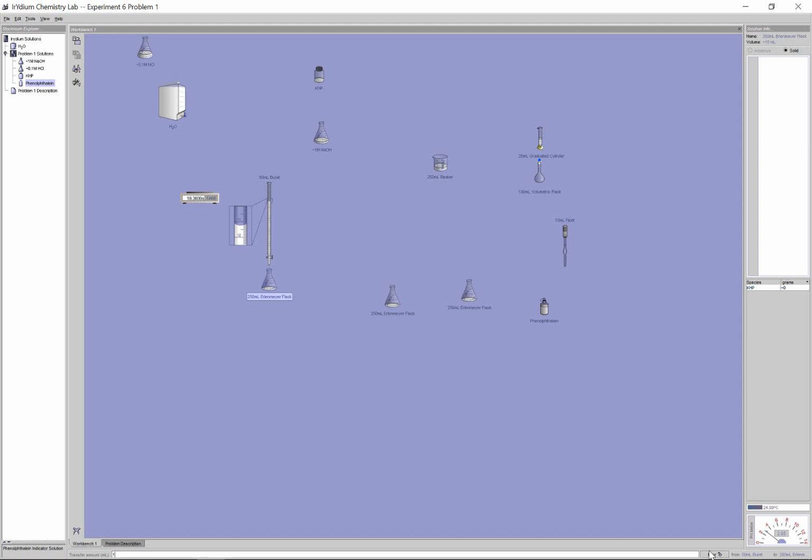I recorded that down. Start transferring in here 1 milliliter at a time. So I'm just going to pour that in. I don't know if I dragged it on top. There we go. So I just poured in the 1 milliliter. Let's pour it in some more. I'm looking for when that Erlenmeyer flask here actually changes color. I don't really need to keep track of how much volume because I can read later on.